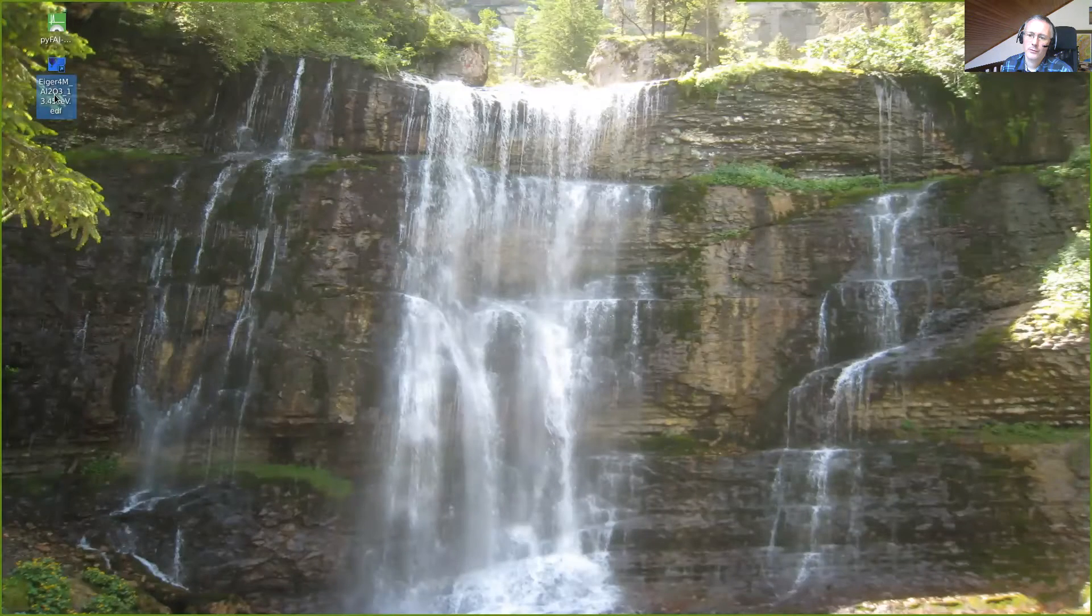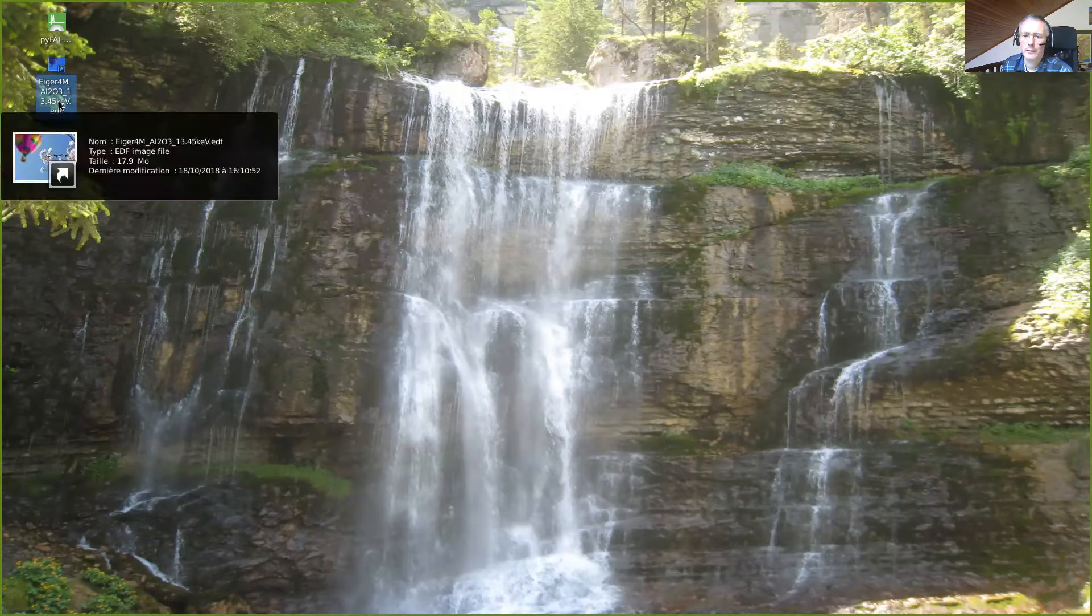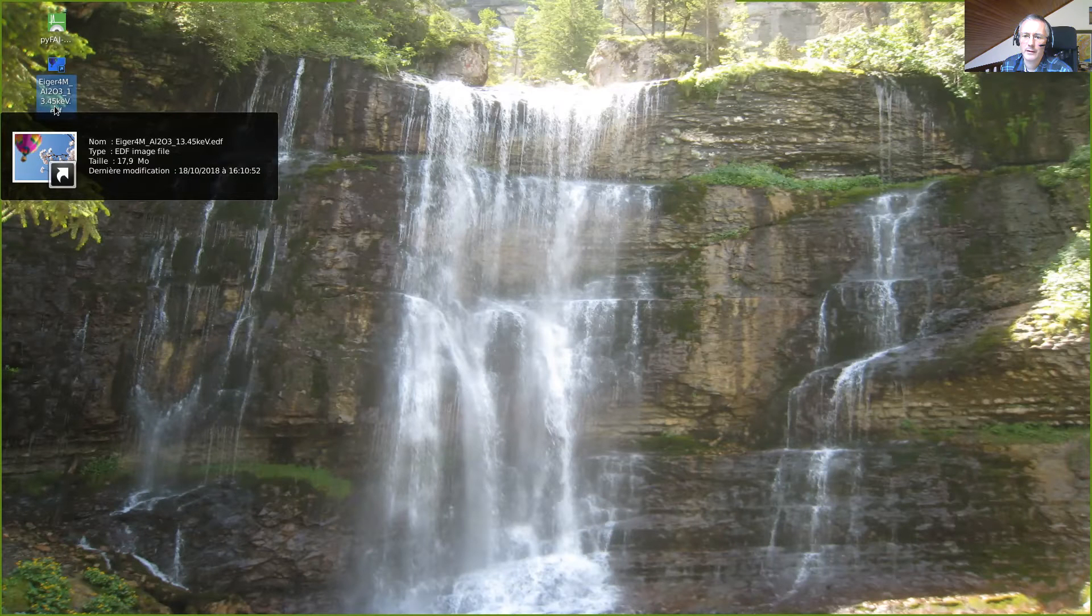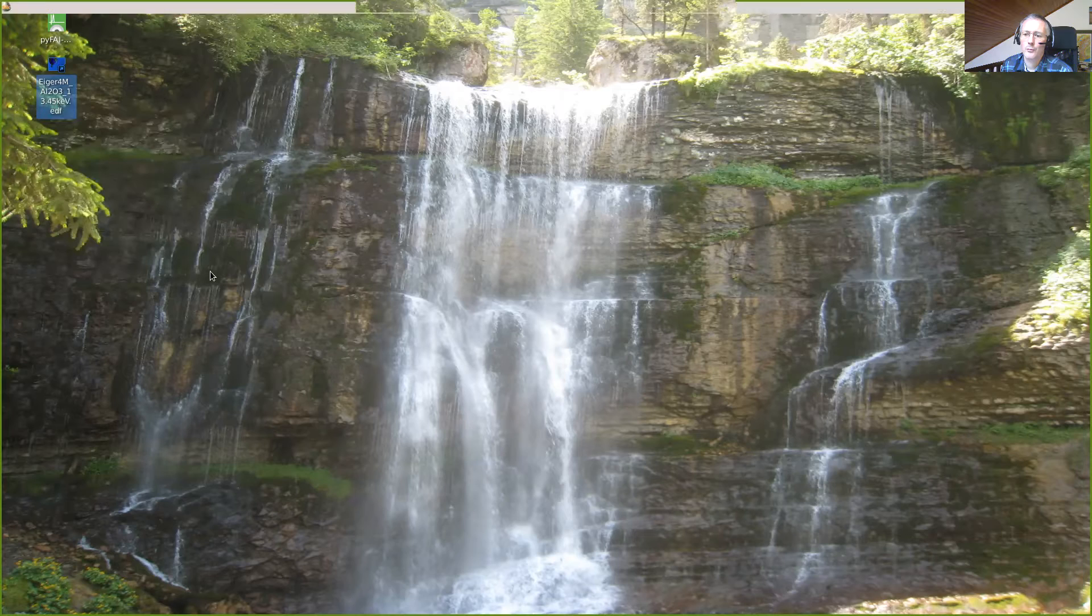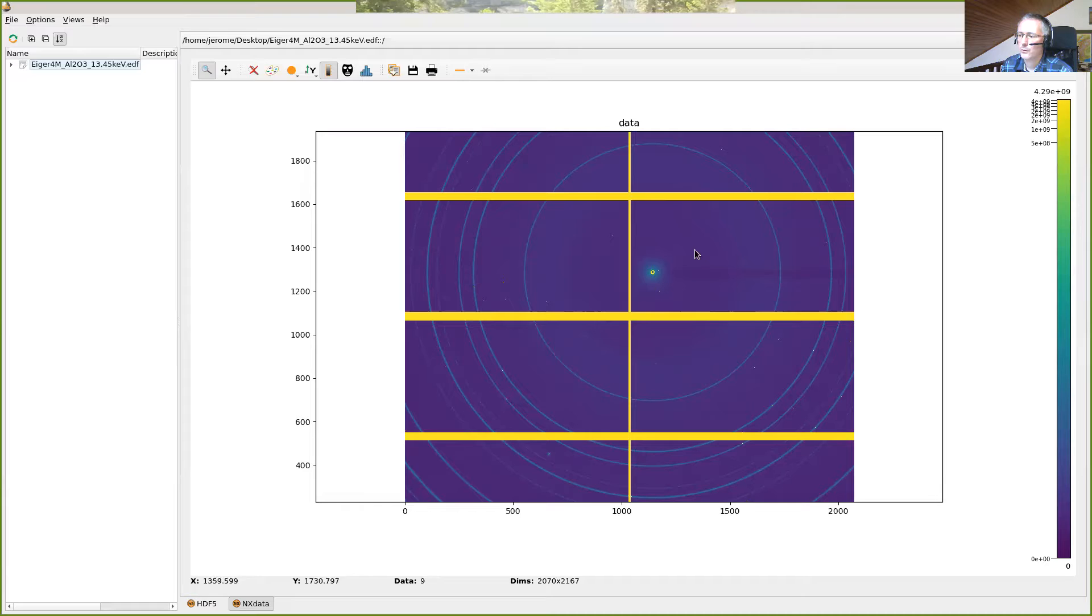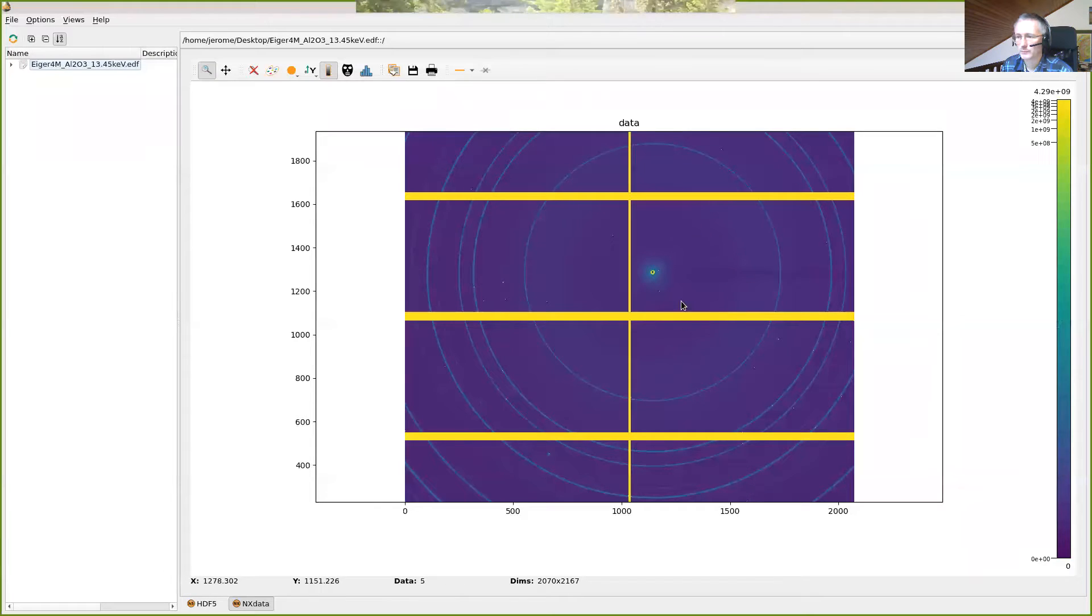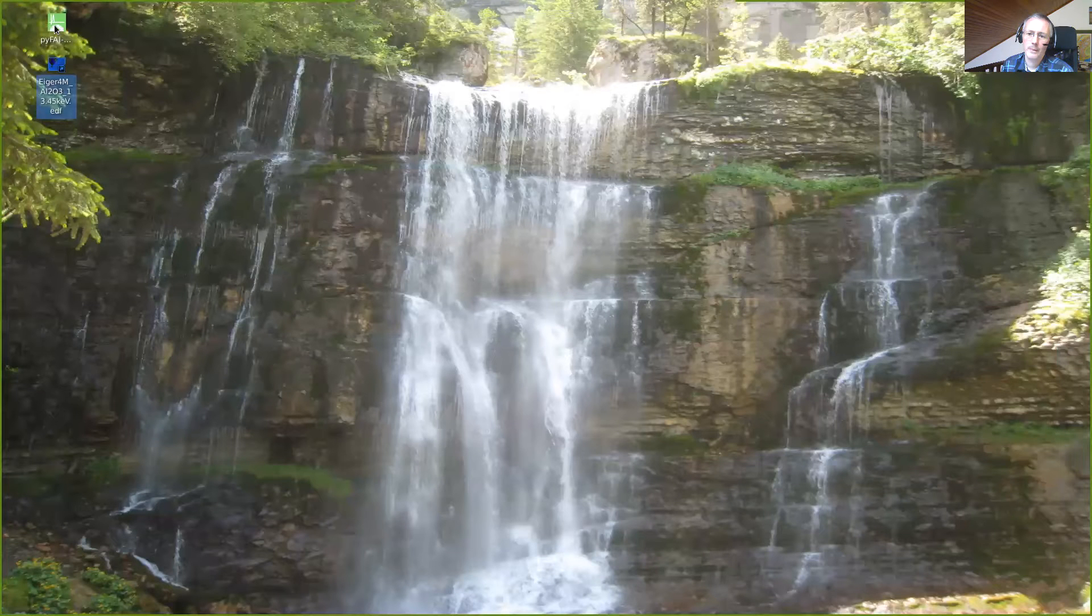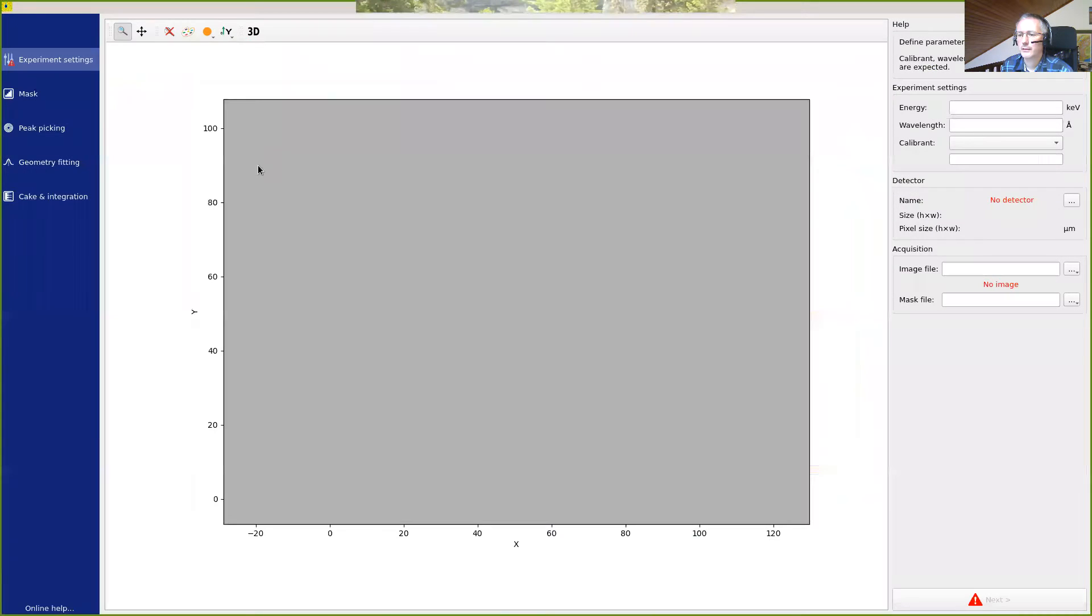So here we have an image called Iger4M, Aluminium Oxide at 13.45 keV. I can open this file with Silex view and I can see that there are nice Debye Scherrer rings on an image acquired with an Iger detector which is composed of different modules and we see here the gaps between the modules with a very high value. To perform the calibration we will use the PyFiFi Calib2 tool that I will just launch by double clicking here.